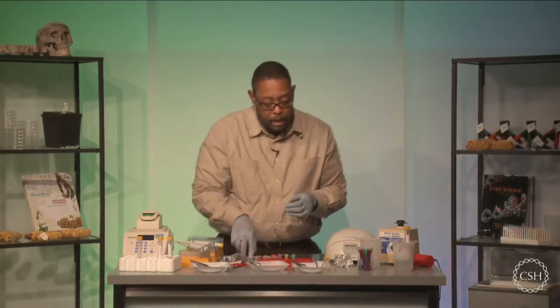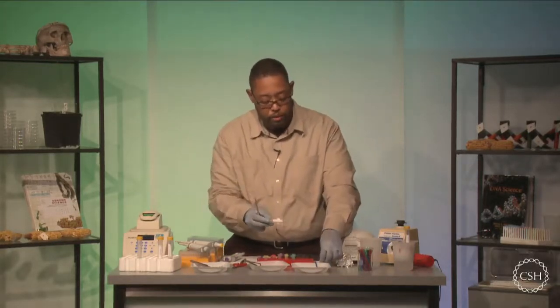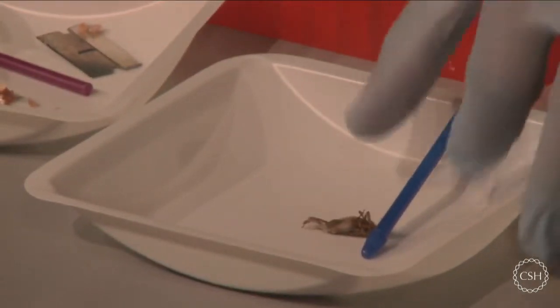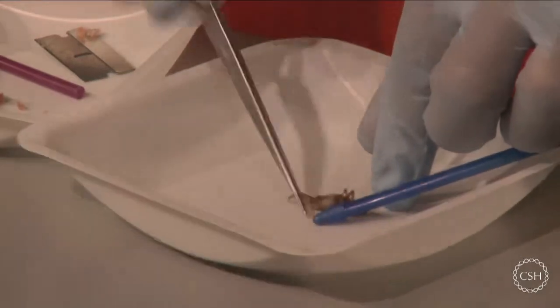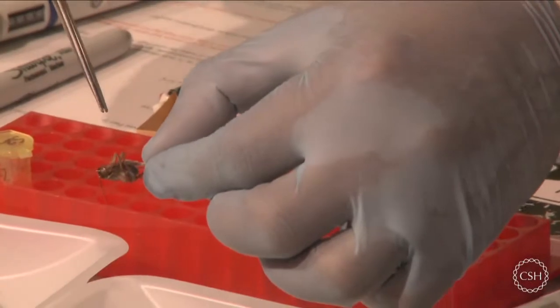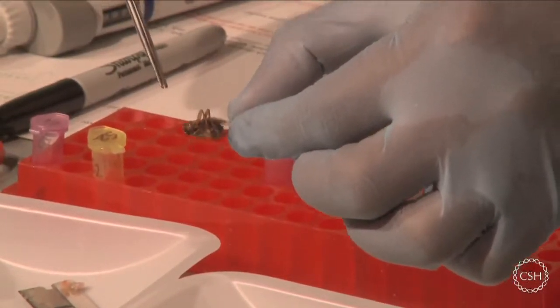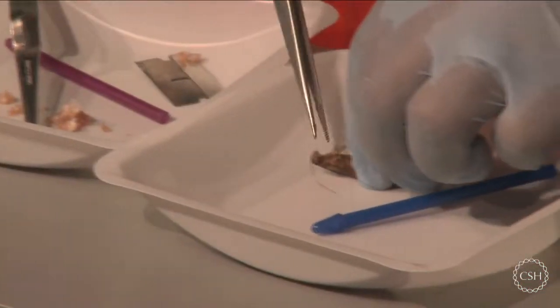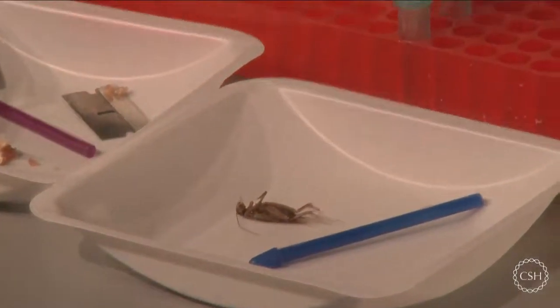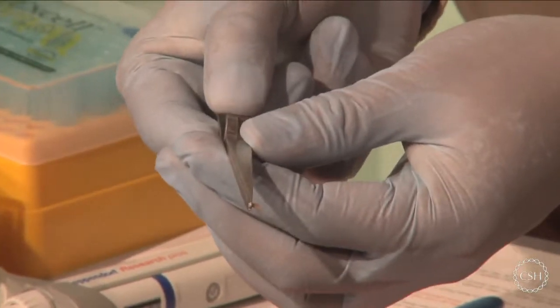All right, now the last sample that I'm going to work with here is my insect, and this is actually a house cricket. This is something you can find around the yard. And all I really want from the house cricket is a leg, okay? You're going to see that the cricket pretty much has enough material for you to work with. Do not take from the body, because this actually will add problems or contaminants to the reaction. So all I want to do is take a leg, and a leg will most likely be more than enough to do this experiment. Now I have a portion of the leg, and that will be enough to do my reaction.